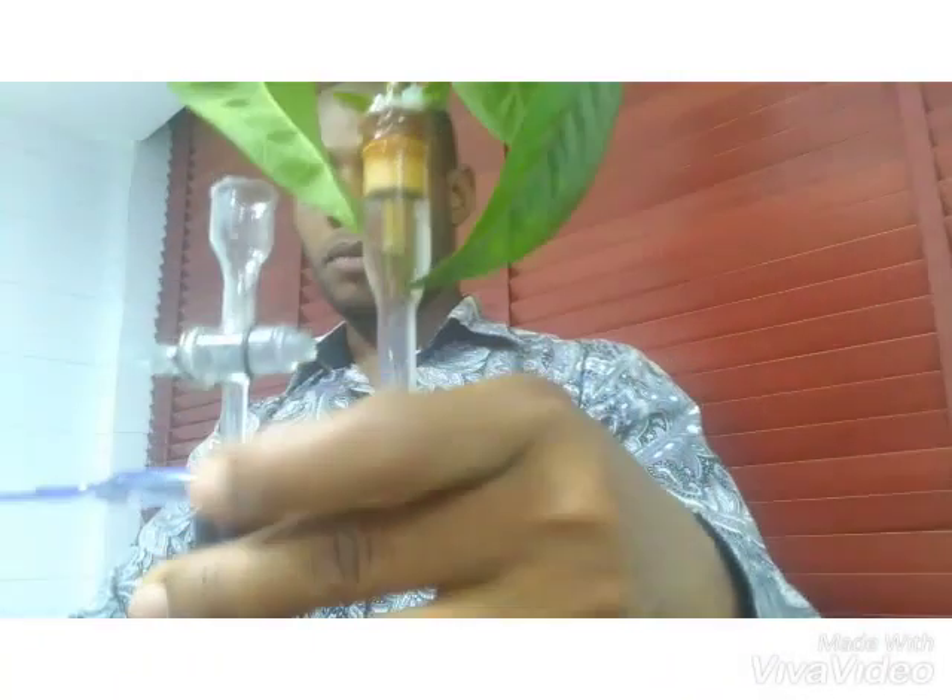You will find that the colored water has gone up the capillary tube all the way from the beaker. You can see this is quite a different color of water from what we had earlier when the experiment was started. If I leave this further, the whole of this space is going to be filled with the colored water.